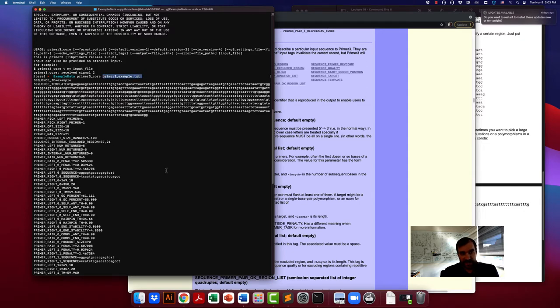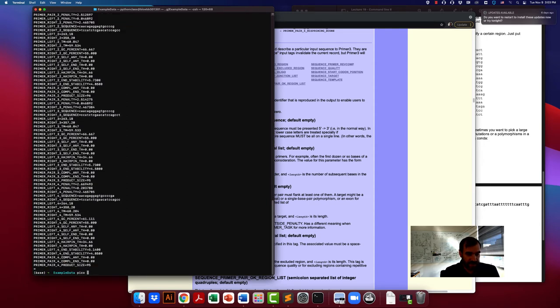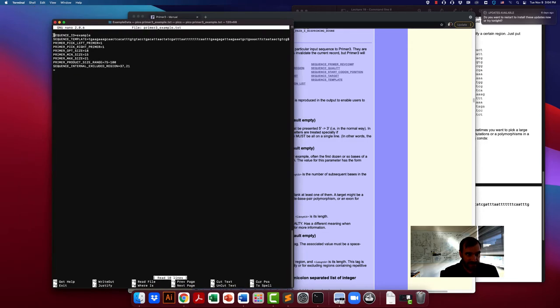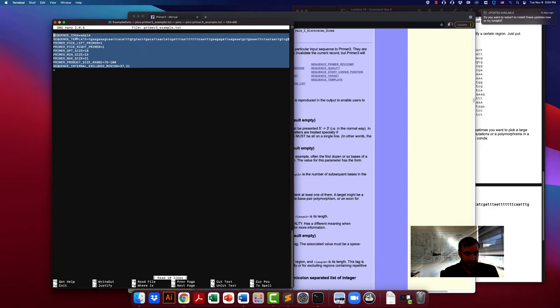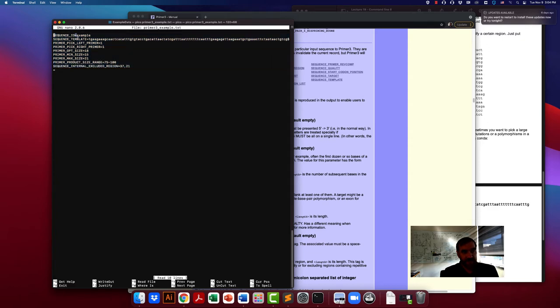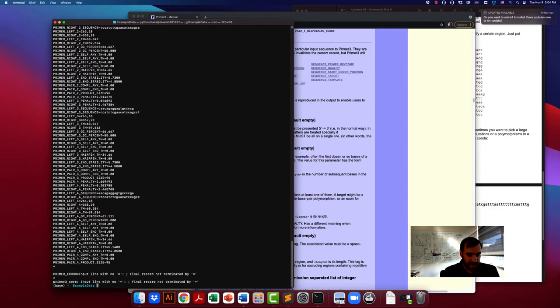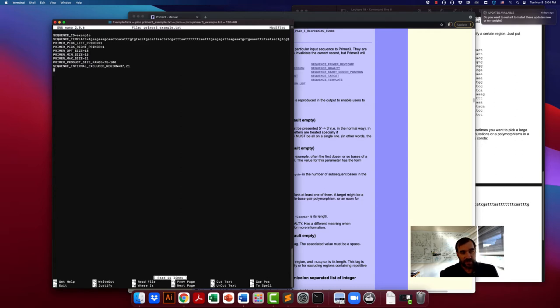I was able to get this to run by providing it with a file called 'primer3_example.txt' that had the appropriate information. Let's see what that file looks like — I'll just pico it. You'll notice it has a number of options all in capital letters, and these options have an equal sign with the value provided after it. We've given it nine different options, and then to indicate we're done for this particular sequence we give it an equal sign. Something important: you can't have an extra line after the equal sign, or you'll get an error saying 'input line with no equals, final record was not terminated by equal.'